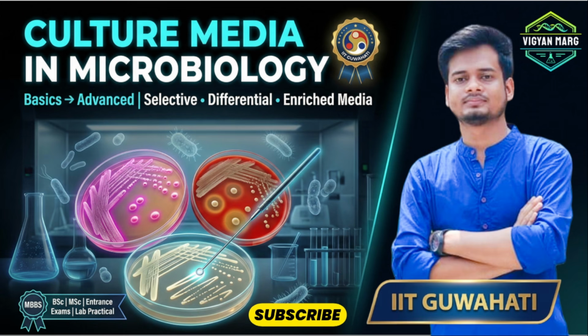In today's video, we are going to build a solid understanding of one of the most fundamental topics in microbiology, which is culture media. And if you have ever wondered how we actually grow invisible microbes in the lab, and why we use so many different types of media like nutrient agar, blood agar, differential media, enriched media, we will learn all of these things throughout this video.